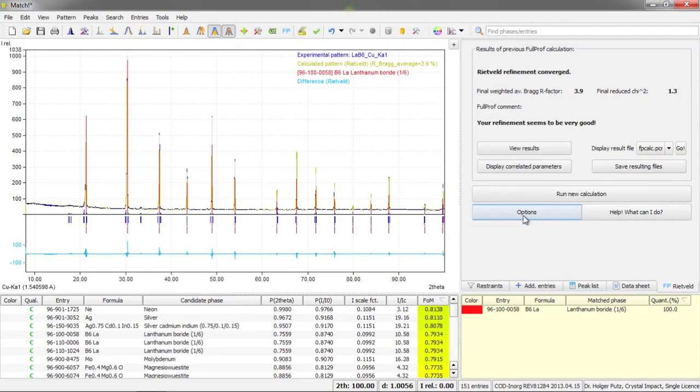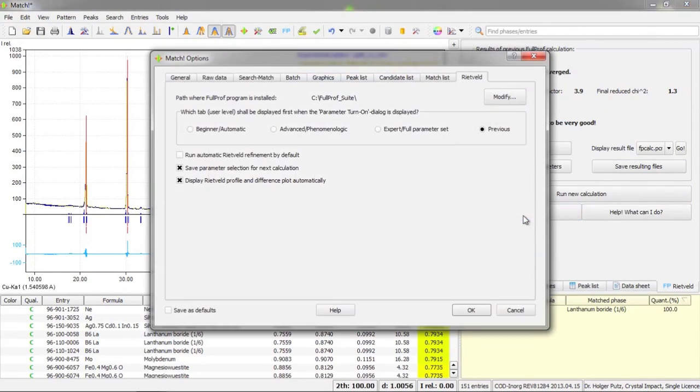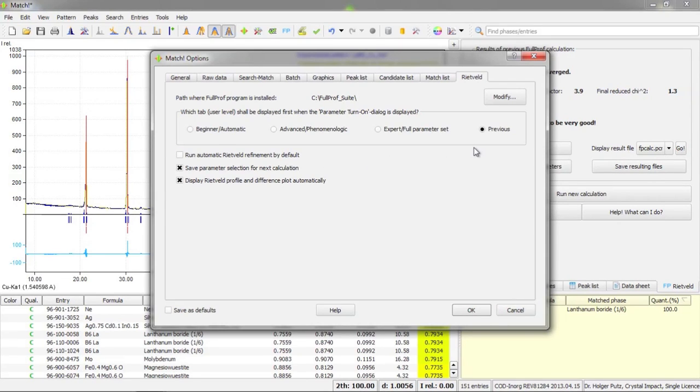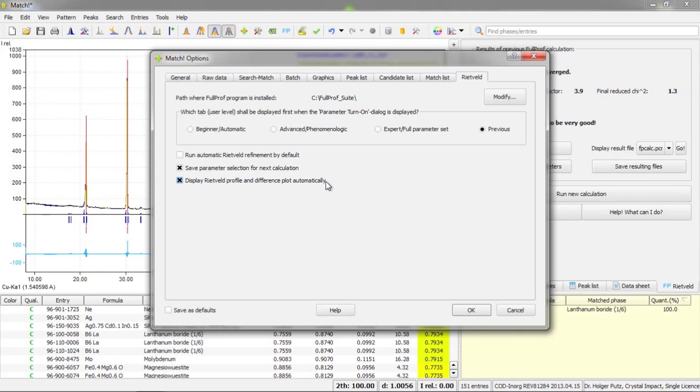We have this button using which you can access the Rietveld options tab of the MATCH options dialog. Here you can for example select the directory where your full prof software is installed. You can tell the program which tab it should display first when you open the parameter turn-on dialog. You can select if the automatic Rietveld refinement should be default or not and some other options.